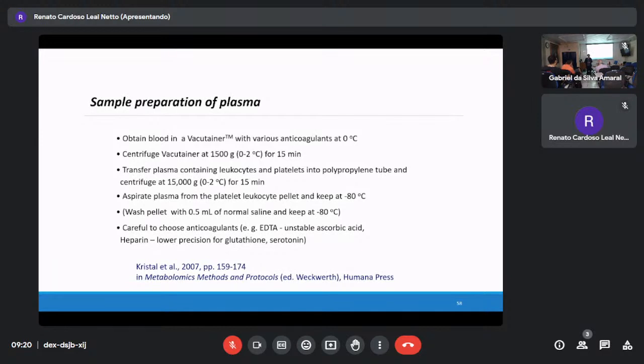So in that case, it's not only the compound, as you mentioned, it's like a conjugated capture. To avoid this, you have to use a fresh sample and an external internal standard, or another internal standard. This is a protein. It's not only the signal of protein, it can also conjugate or interact with other small molecules that you cannot detect.